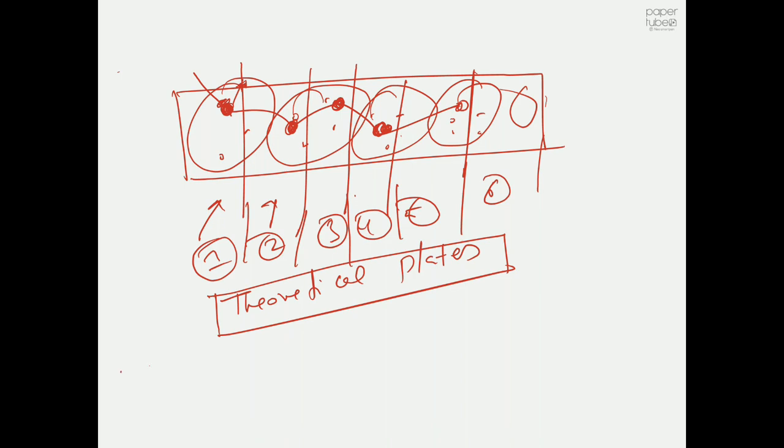We will cover that later, but for the moment, what we understood is how to perform the experiment, how to add your silica particles. We defined the different terminologies. We know what is stationary phase, we know what is a mobile phase, we know some fancy terminologies: eluent, analyte, and eluate. Eluate is nothing but a mixture of eluent plus one of your analytes or more than one of your analytes. And then we know what type of material we are going to use. We are using silica, because silica is a very good adsorbent for most of the molecules. And then we can also easily dissolve the adsorbed molecules from the silica surface using a common solvent or a solvent mixture. So these are the main reasons. And then we learned a bit about something called retention time.